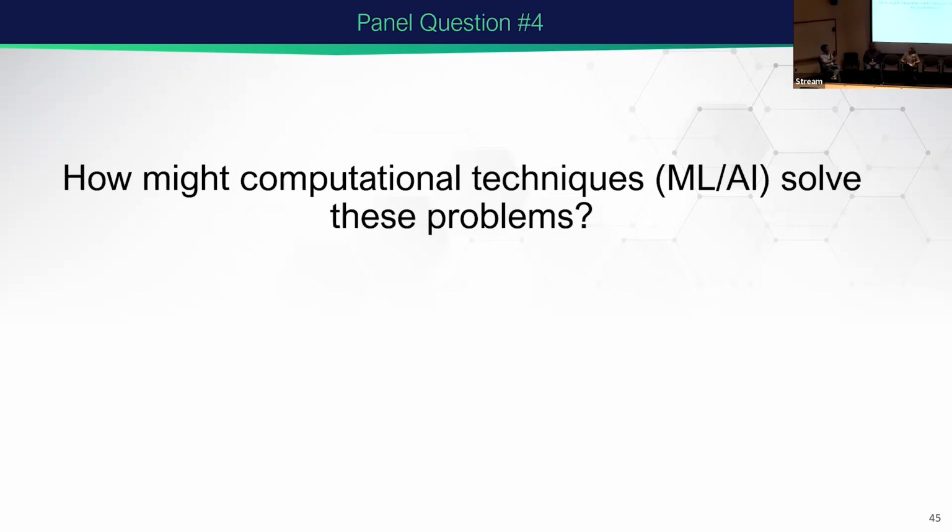Yeah. And another would be clustering, which is probably one of the most powerful ways of analyzing mass spec imaging data. There are thousands of mass spec images, and a clustering program will sort out which images are similar to each other. The problem is right now there is no good judgment of how many clusters is the best. Depending on the biological system, if you cluster into 5 groups, that would be the best; if you cluster into 3 groups, that would be the best. But currently, people just use random approaches and then go with it.